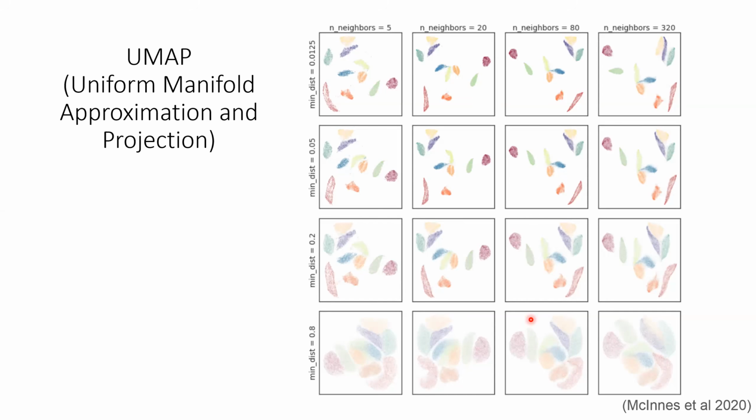What we think is happening is that in the dimensionality reduction process, we have to slice regions that are connected in high dimensional space to project them onto this graph in 2D space. So while the clusters may look far apart here, they might actually be really close in the high dimensional space. So again, it's not appropriate to use UMAP coordinates for downstream analysis, even though it is unfortunately very common to talk about the data like it is preserving some sort of structure in presentations.